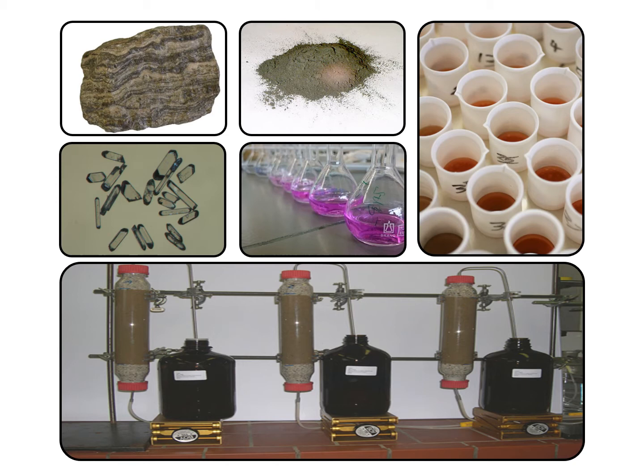But with ICP techniques, you either want to take a whole rock and powder that, dissolve it up in nasty acids to create basically a solution, or you might be able to separate out some crystals by just picking them out, or picking out some individual fossils from the sediment, and then doing a bulk dissolution of those. So for ICP, you basically need to dissolve your sample. There are some exceptions to that.